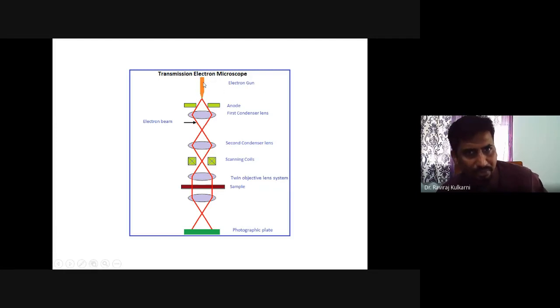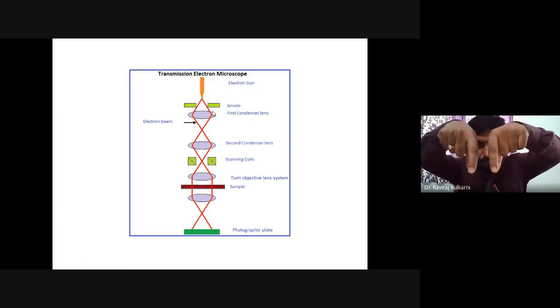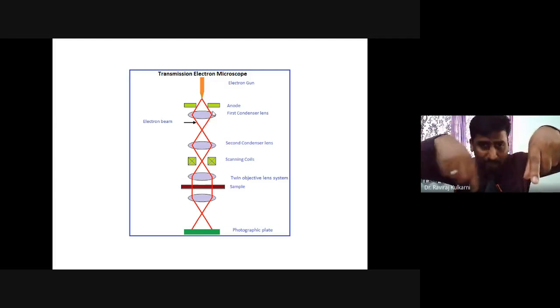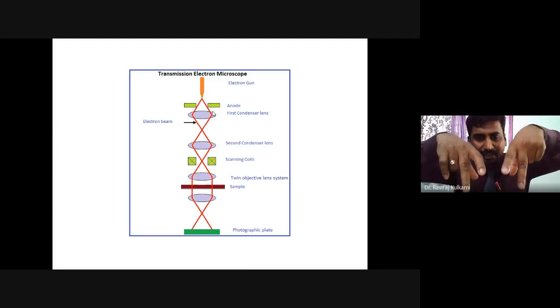Here we use an electron gun. Electrons are fired, and you require a condenser lens. It's not a normal optical lens. What we have is electromagnetic rods, 4 rods or 8 rods, which are connected to alternating current. Opposite poles have the same charge.